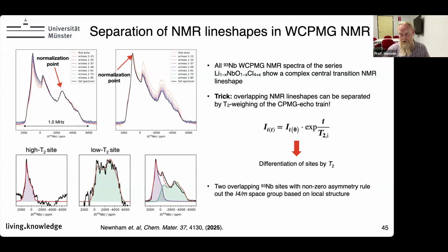On the other hand, from chlorine, we see that in some of the cases for the bridging chlorine, we get an eta of 0. So locally, it's probably a mixture of both. This is probably why you can't decide the space group from XRD perfectly.